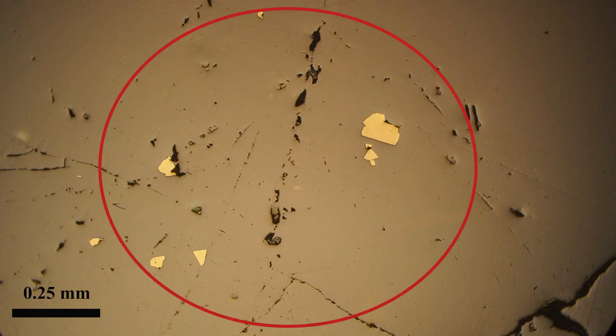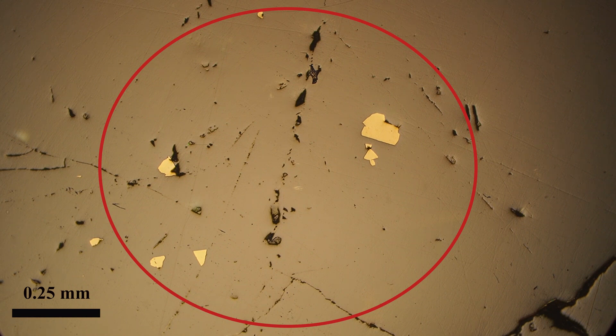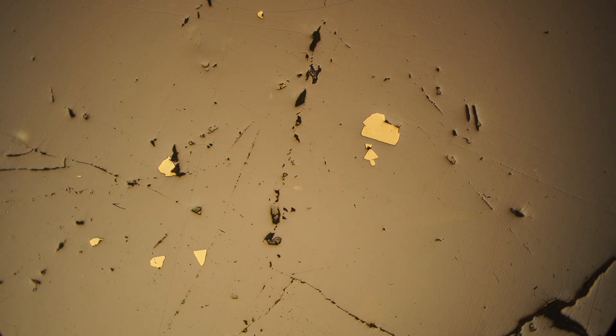Hi everyone. Today we're going to talk about how to identify sphalerite in polished section. So here's some sphalerite with some pyrite inclusions in it.